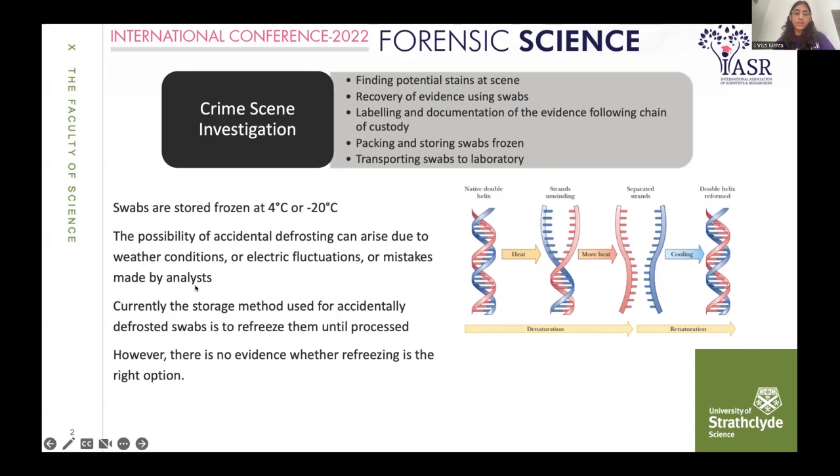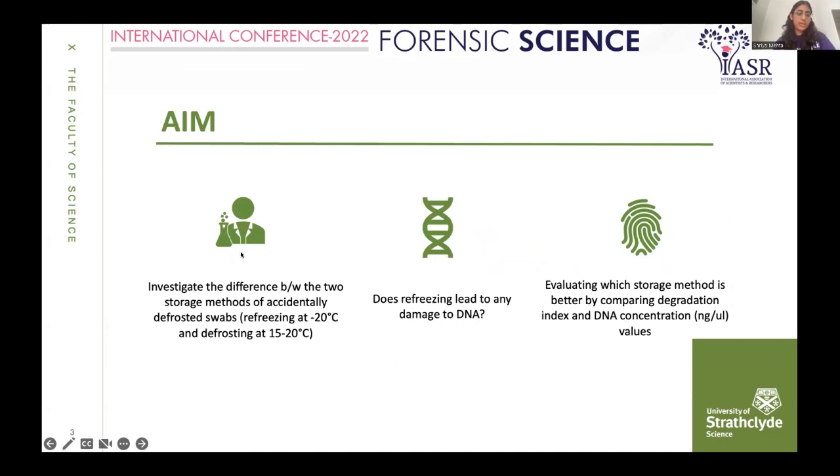The current storage method used for accidentally defrosted swabs is to refreeze them. If a laboratory receives a swab that is accidentally defrosted, scientists put them back in the freezer because it's been shown that the DNA will renature. But there is no scientific evidence whether refreezing is the right option. The aim of my study is to investigate differences between two storage methods: refreezing at minus 20 degrees Celsius, and storing under ambient conditions at room temperature, which ranged from 15 to 20 degrees Celsius during my study.